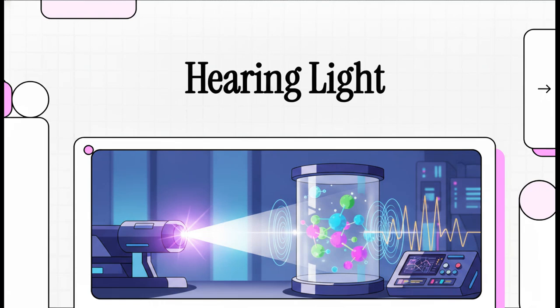Welcome to this explainer. I'm Dr. Ken, and today we're literally going to listen to the sound of light. Imagine a futuristic lab where laser beams are striking gases, liquids, and solid materials. We're embarking on the incredible journey of a photon, diving deep into the magic of photoacoustic spectroscopy, or PAS. You'll see light energy being absorbed by glowing molecules, followed by the generation of these tiny, rhythmic pressure waves. It's a world where optics and acoustics collide in the most beautiful way.